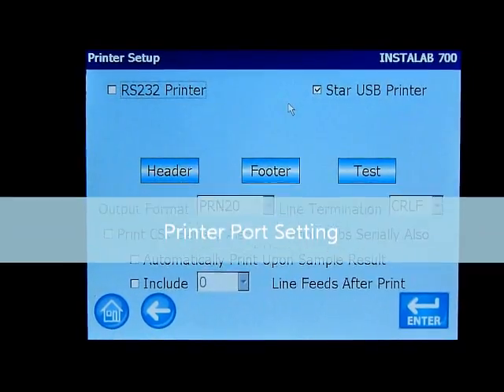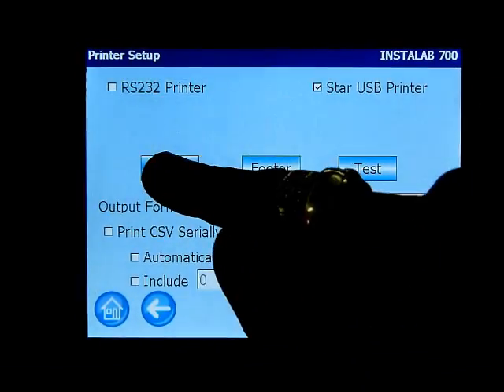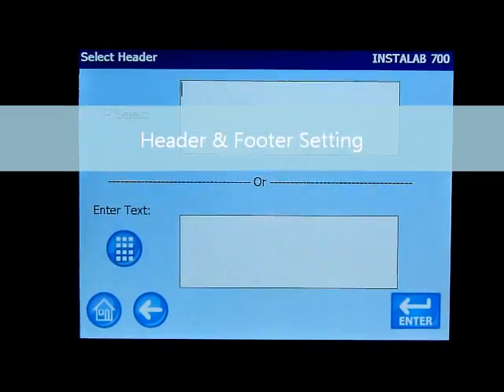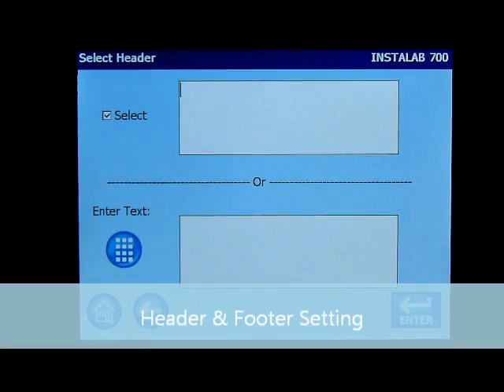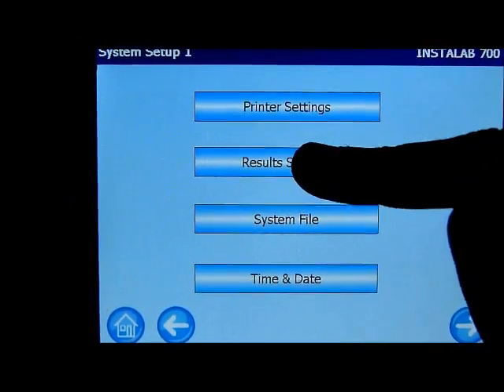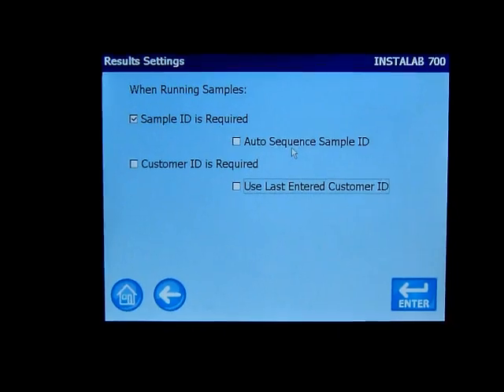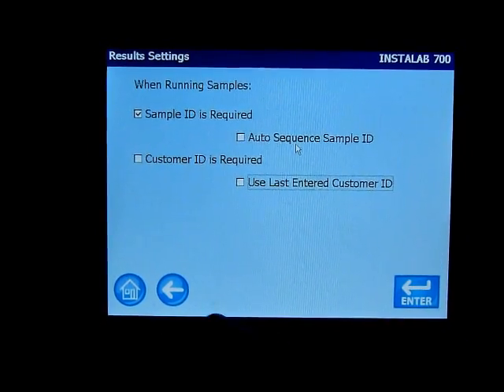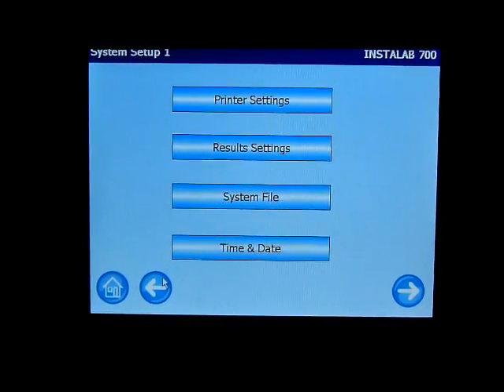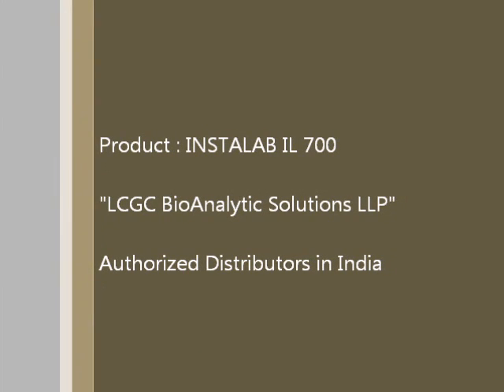You can also access the settings option. We can go to the system settings menu, which includes date and time, system file, results setting, and printer settings. In the printer settings, you have the provision of connecting either an RS printer or a USB printer. You can customize the header and footer, and there is also a provision for automatically printing readings after every sample analyzed.